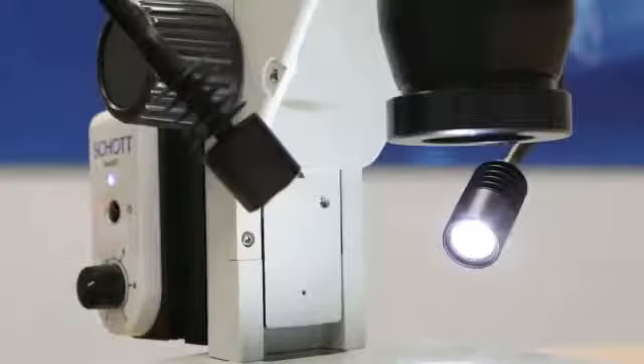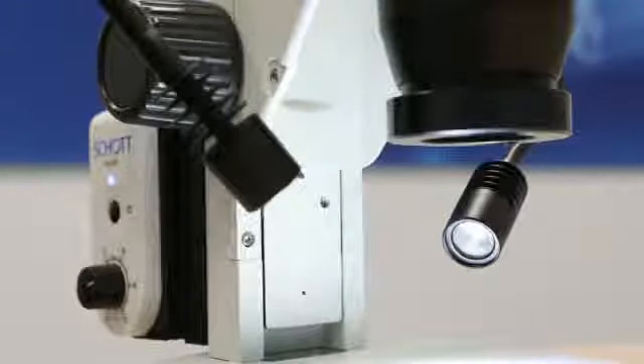To turn on the device, simply click on the black power button. Clicking on it once will turn on the right light head. Clicking on it a second time will turn on the left light head. A third time will simultaneously turn on both lights.